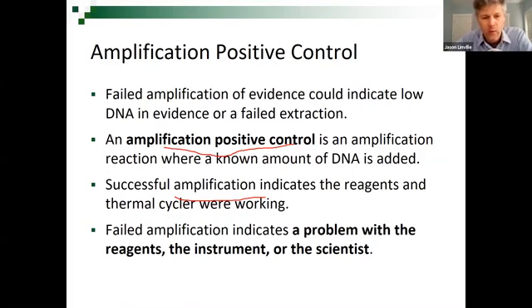All right, what happens if you get a failed amplification? That's something that is not supposed to happen. If somebody could answer my question in the chat box here, what should you do if something goes wrong? Anybody? This is a life lesson, remember?